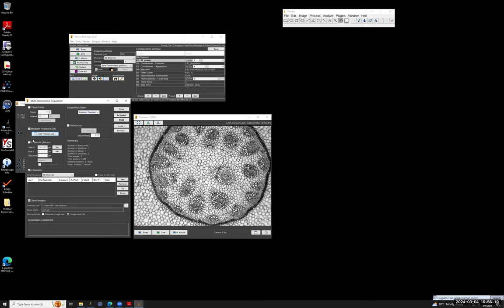the easiest are multi-channel images. So I can add here different channels. It will add channels in the order in which they appear in my list of channels. I can put here all the channels, and then I can select which of them I want.